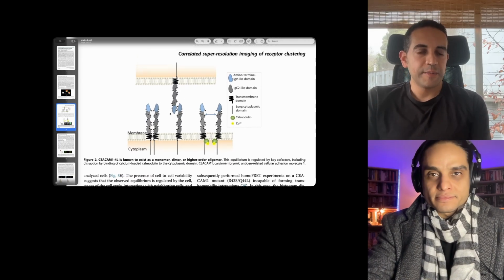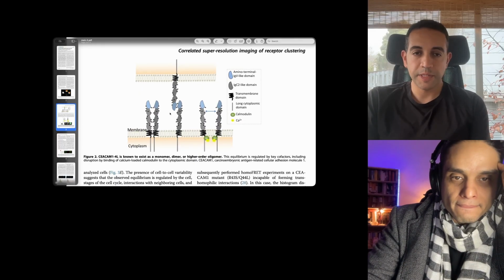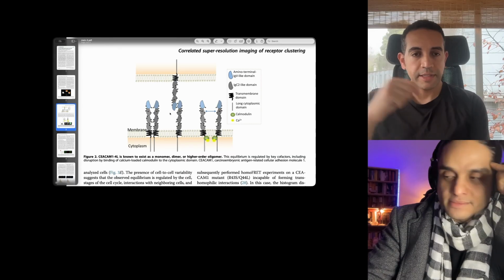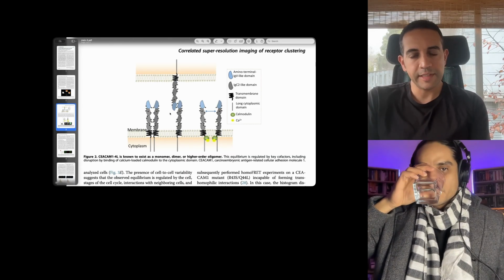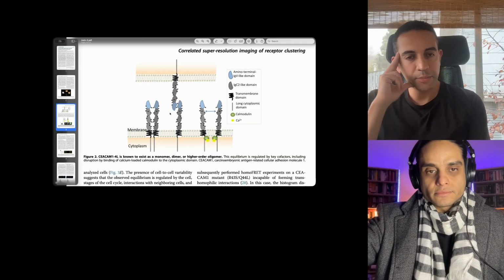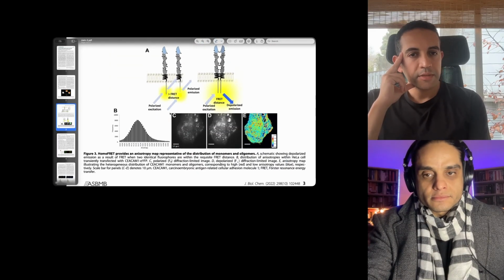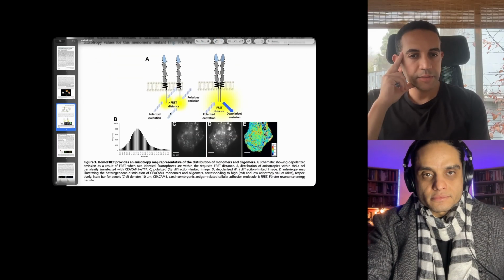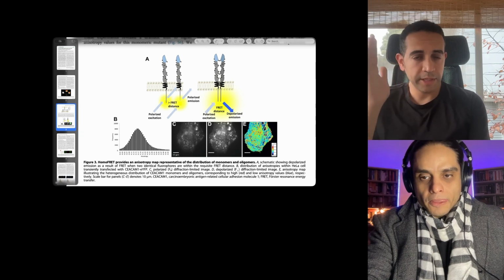And this is just the transmembrane protein I was talking about, and it's forming dimers and monomers. It's forming also intercellular interactions, and that was just to show that calmodulin is able to break the dimers. So there are some cofactors that are important. But if you go to the next one, so that's just the FRET that I was talking about. And if you look at CDE, you're able to capture the polarized, depolarized emission.